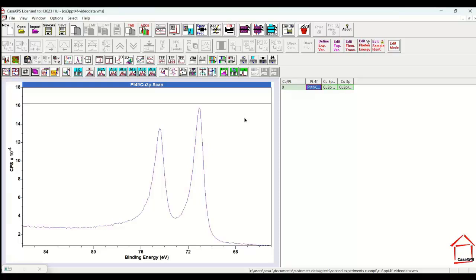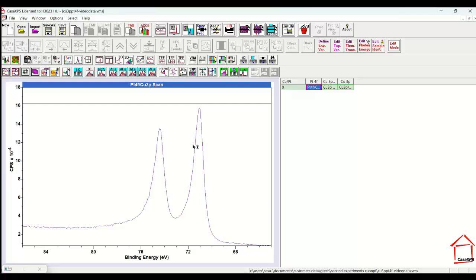But in order to construct a peak model, we have to come up with components that correspond to the different chemical states within a material. And then we have to relate these components in some way, relational constraints between the different photoemission lines. More importantly, what we have to do is come up with line shapes for these component peaks that correspond meaningfully to the background curve that we choose to remove the inelastically scattered signal from these data.